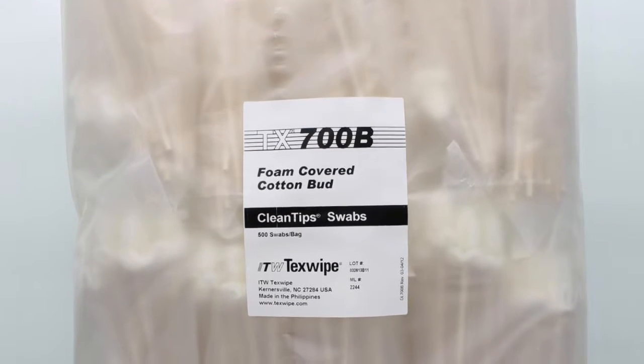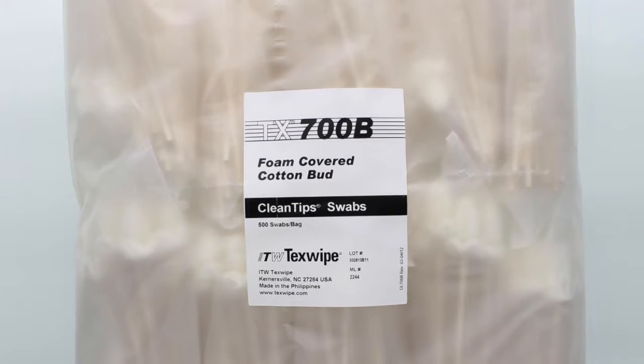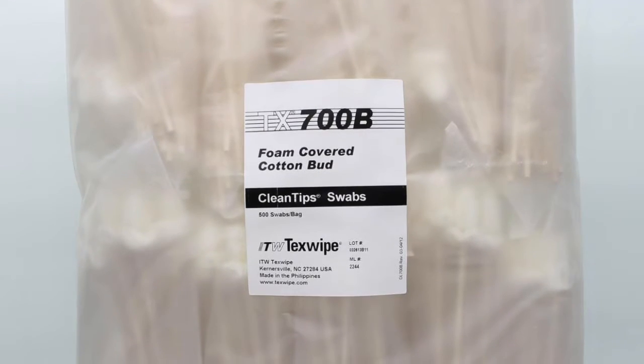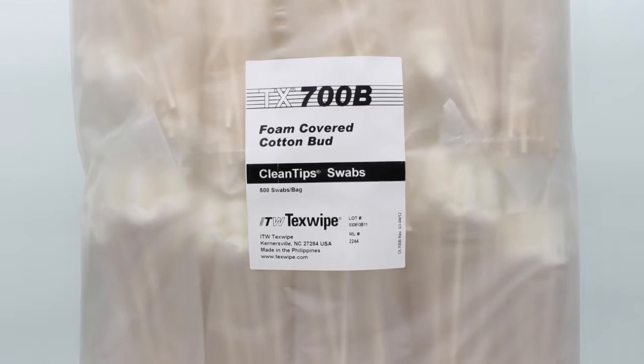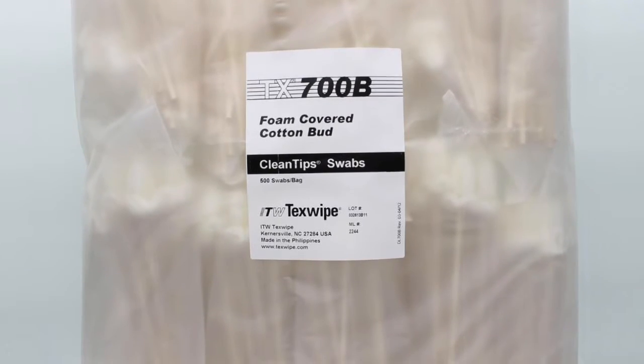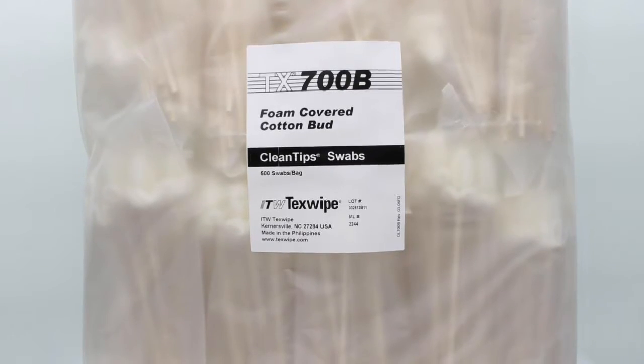These swabs are sold in bags of 500, and within each bag there are 10 inner bags of 50 swabs. SOS offers discounts for case quantity orders online at SOSCleanroom.com. A case consists of five bags of 500 swabs.